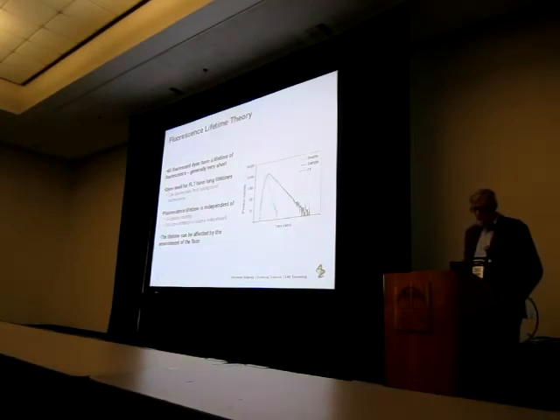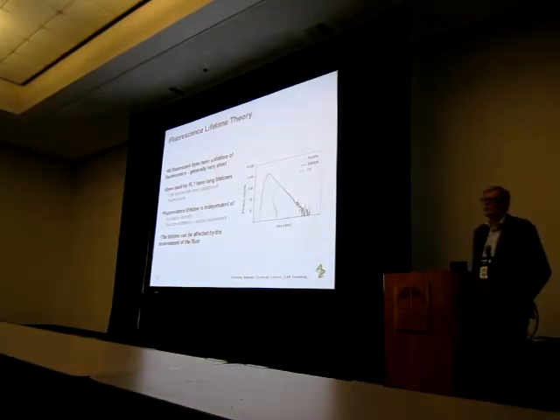The thing that attracted us to FLT in the first place, and one of the reasons we wanted to do the evaluation, was really to test out whether or not there were fewer artifacts than with other fluorescence-based technologies.